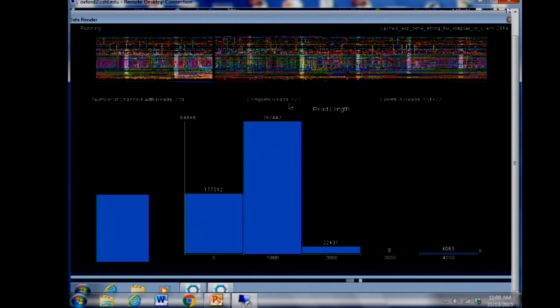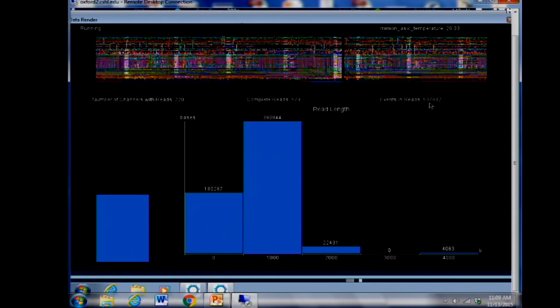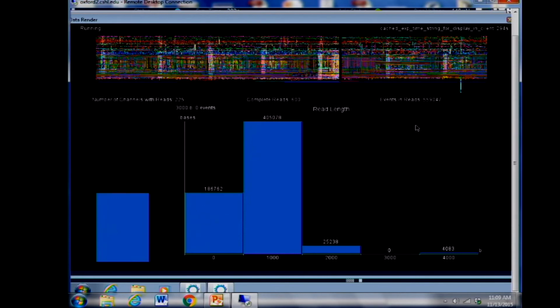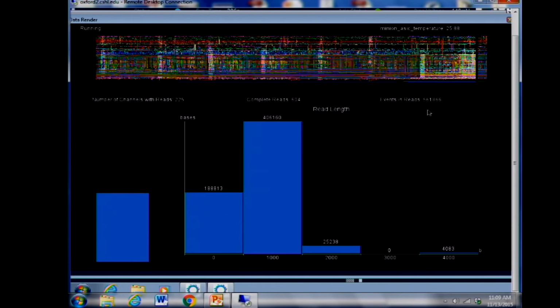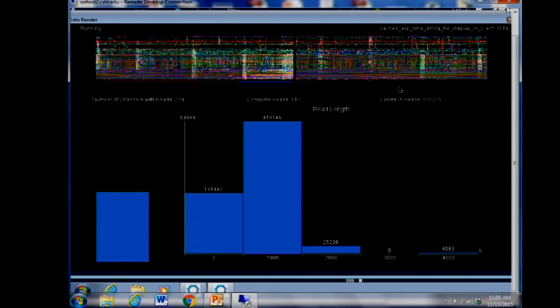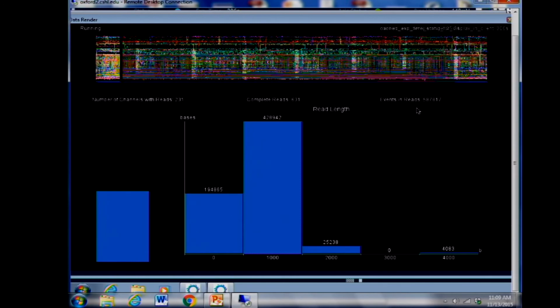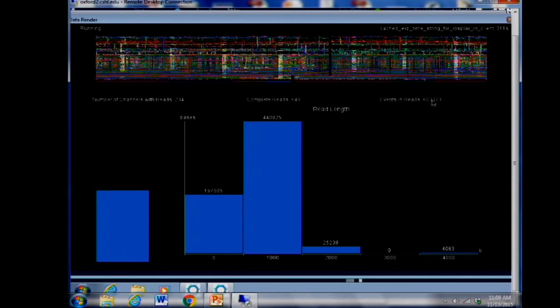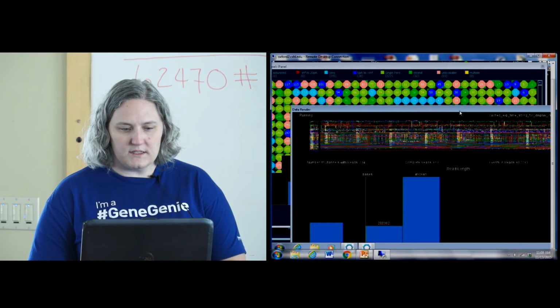Complete reads, this is when it's done, okay? And events in read, so that's a 6-mer in this case. So this is the number of 6-mers that have been identified. It is a very, very rough estimate of how many bases have gone through this sequencer. You don't divide it by 6 because there's one event per base approximately. But this gives you a very general idea of how many gigabases you've actually sequenced. So right now we have sequenced around 600,000 bases. So not too bad. This is all real-time information.